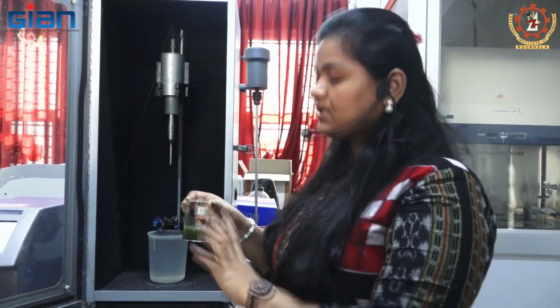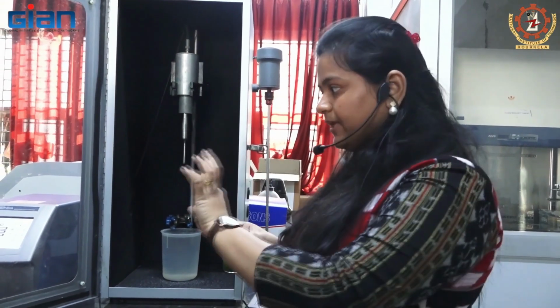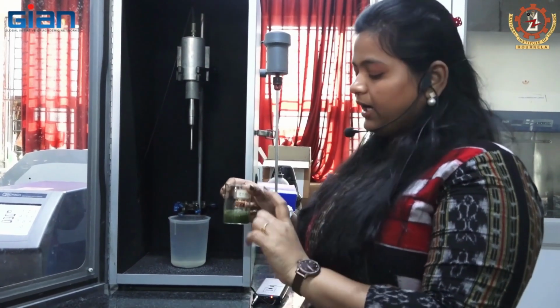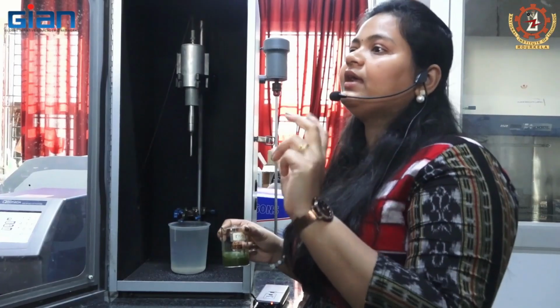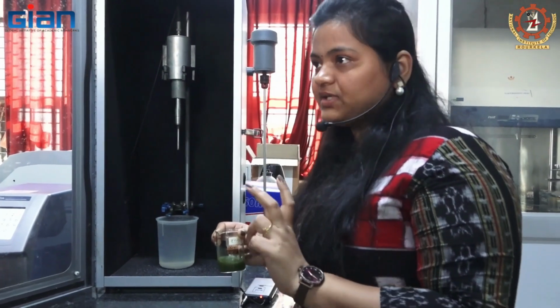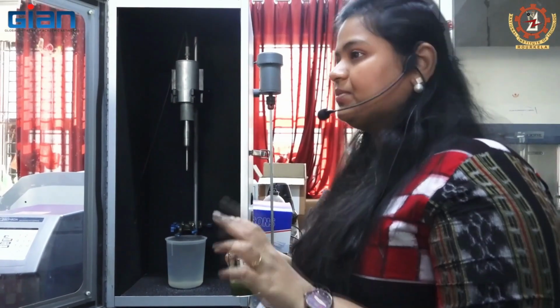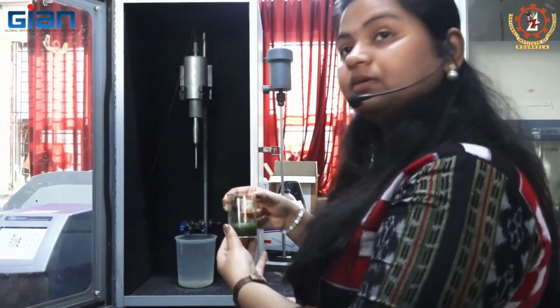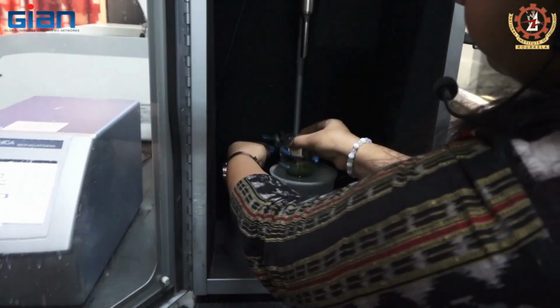That condition is 60 amplitude at 5 minutes, and if you take 2 grams of sample and 30 ml water, you can get a higher yield of the bioactive compounds. That has to be optimized before doing the ultrasound experiments. Okay.